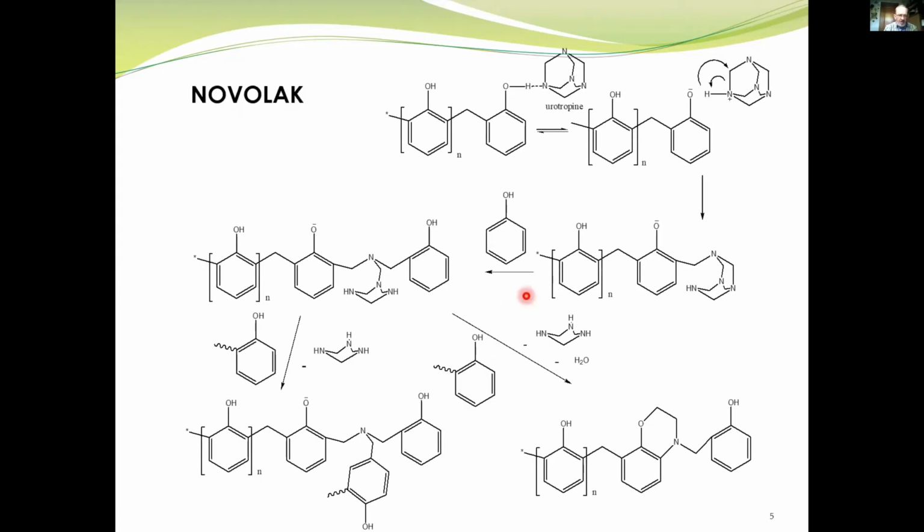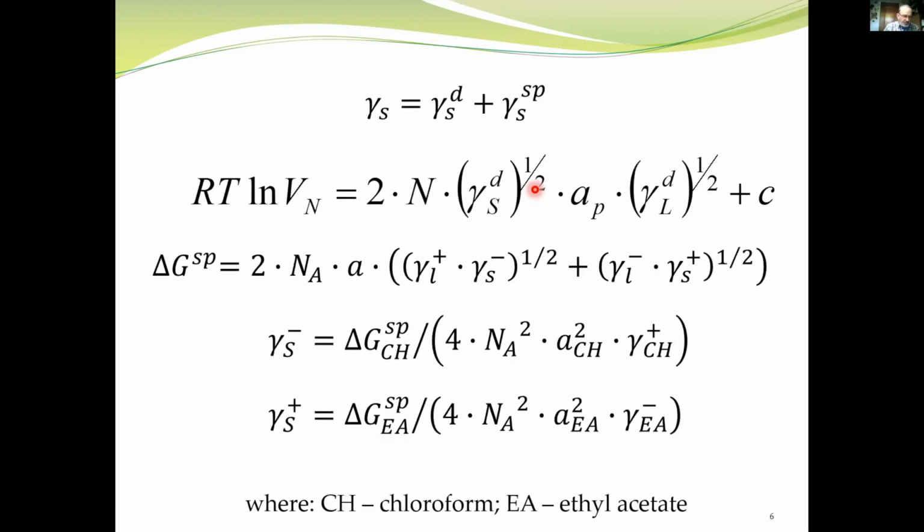Here we have a typical chemical process, and the setting material is urotropin, which enables the formation of proper structure. We used several techniques to check the changes occurring in the storage of material.